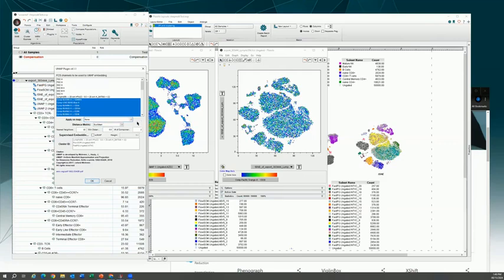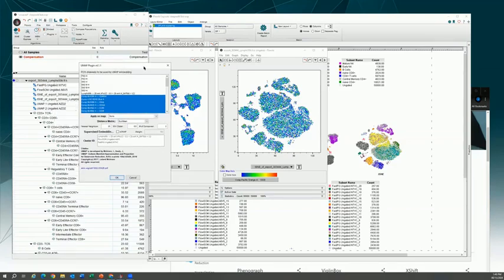Once you have that first embedding that runs quickly, go back, select your 10 million events, and apply on map from your first embedding. That already has some information calculated about the nearest neighbors, the distances, and things like that, and it allows you to do that calculation even on a huge number of events. That can be a way to get around an issue if you don't have the amount of RAM available on your computer.